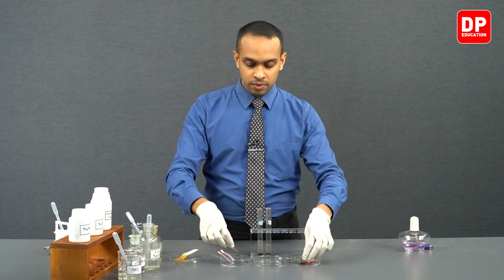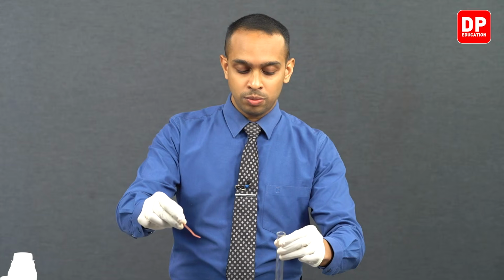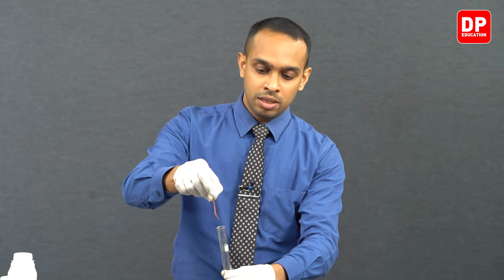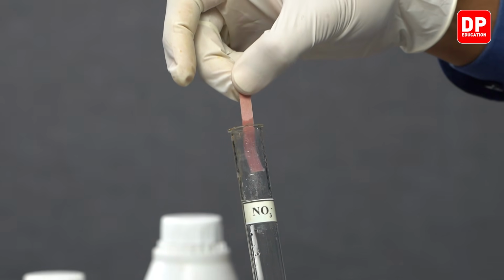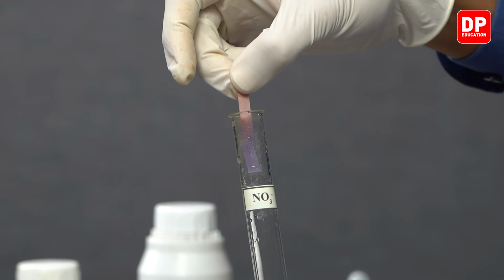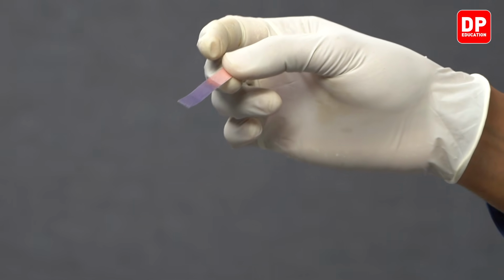We'll take a red litmus paper that is soaked in water, or that is made wet with water, and if you insert it over here, you can see the red litmus paper will turn blue. This indicates that the gas that is released is basic.